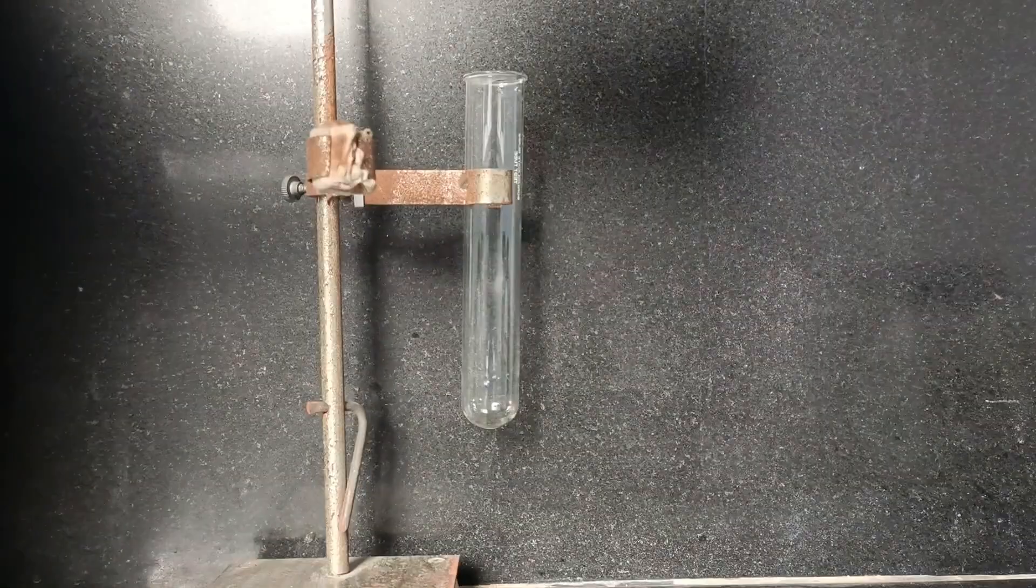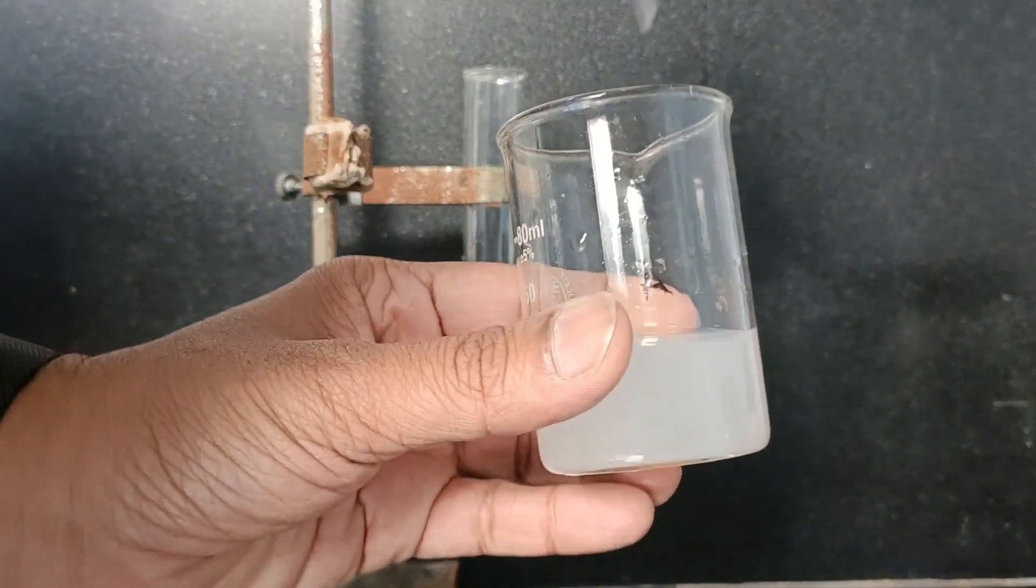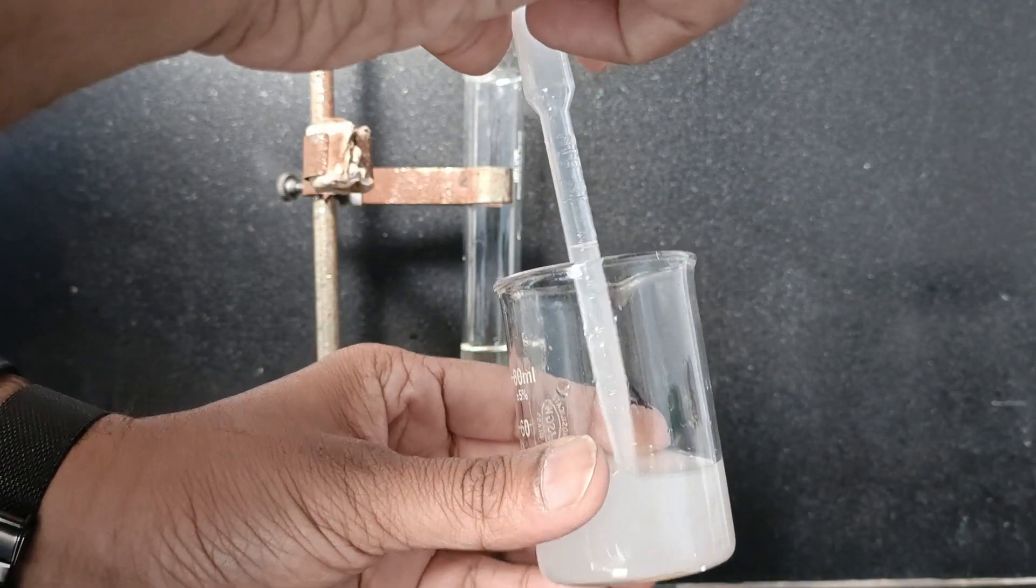I am going to take some amount of potassium hydroxide solution in a test tube. With the help of a dropper, I am going to take some calcium chloride solution and add it into the potassium hydroxide solution.